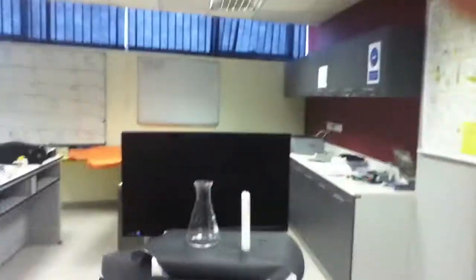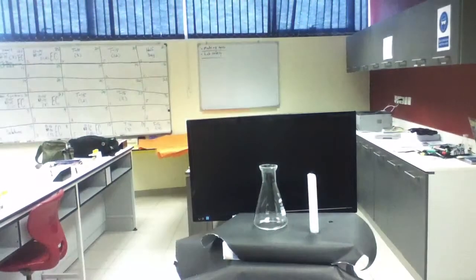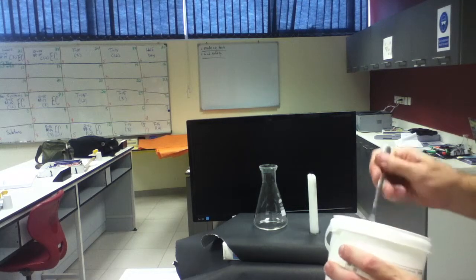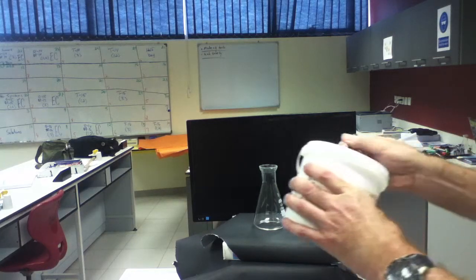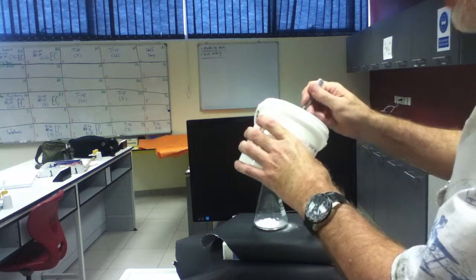All right, let me put this back. And we'll go like this, and we're back. All right, now. Okay. So what I want to show you is the nature of a gas. Okay, just a little bit. This is not everything you want to know about a gas, but this is sodium bicarbonate. Okay, this is an Erlenmeyer flask.